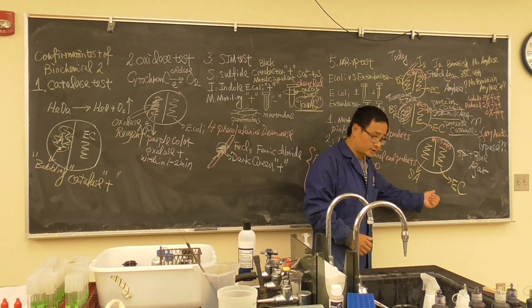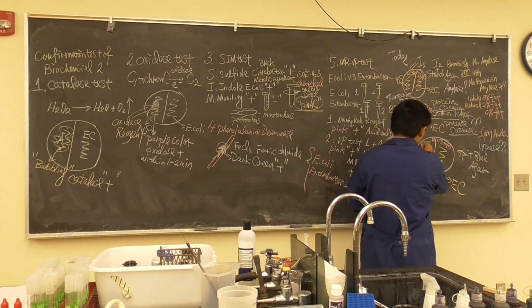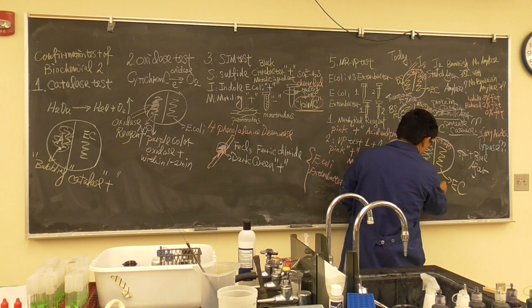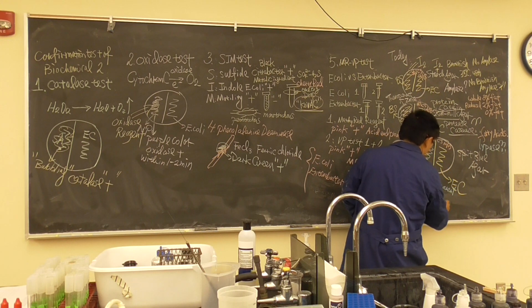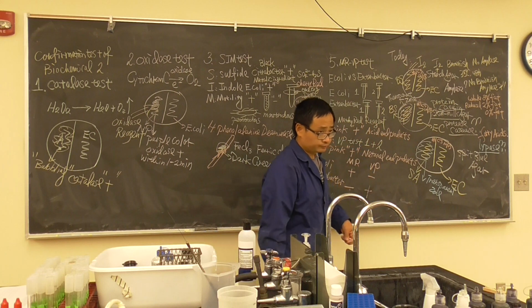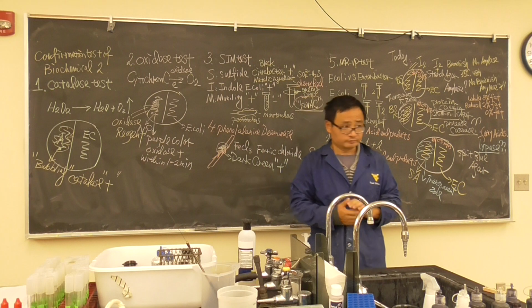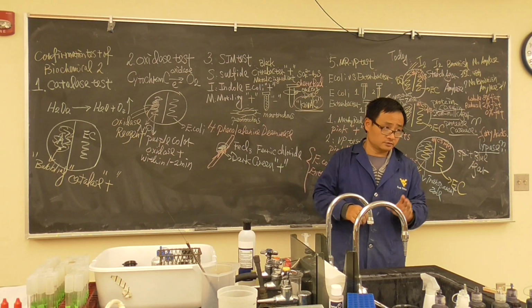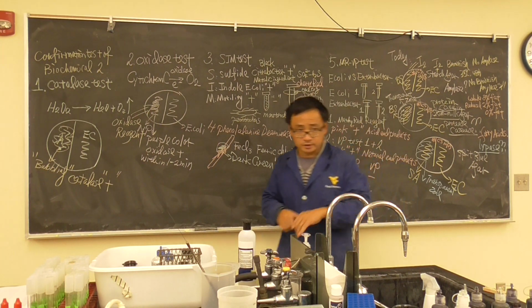We don't have lactic acid bacteria, we have Staphylococcus and E. coli. Same thing. If you see a transparent zone after incubation, which means it's lipase test positive. Okay? So today's work, what do we have left? 3 plates everybody gets. Starch agar, spirit blue agar, and skim milk agar.